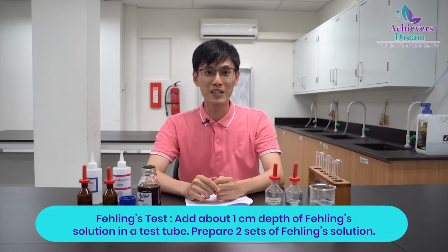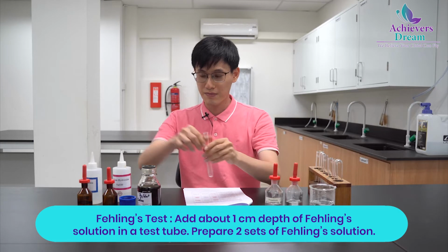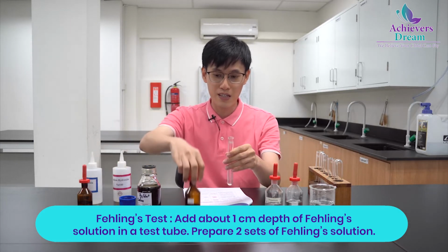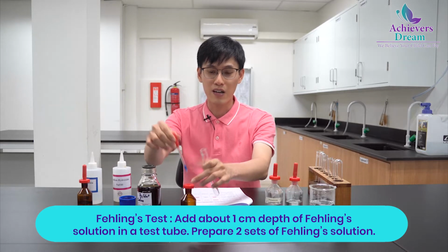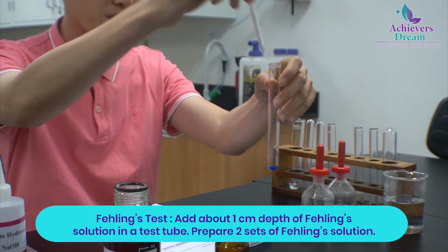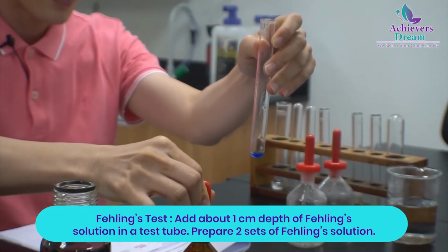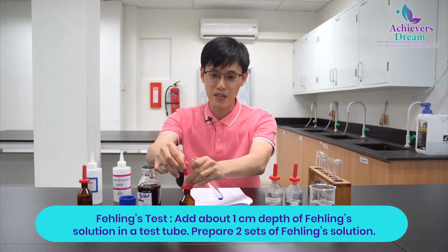Now we will be doing the Fehling's test. For the Fehling's test, what I have on hand is some Fehling's solution. Fehling's solution is an alkaline solution of copper 2+ complex with tartrate ions. That's why you see the intense blue color, which is due to a complex ion formation.